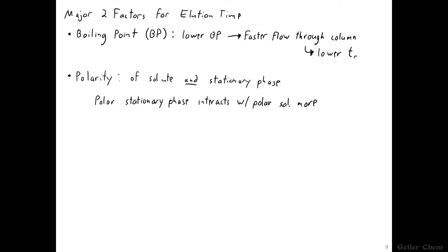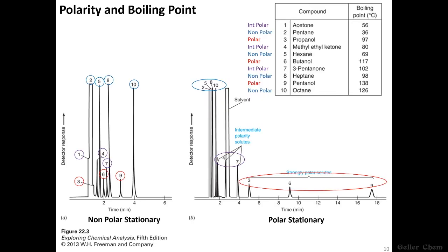Are they similar or different? I'll finish the notes on polarity by just rewriting that phrase but replacing the word polar with the words nonpolar. So I'll just write quotes, nonpolar stationary phase interacts with nonpolar solutes more, end quotes. Now let's see the interplay between these two factors with an example. Starting with the chromatogram on the right side. This one's easier to make sense of.